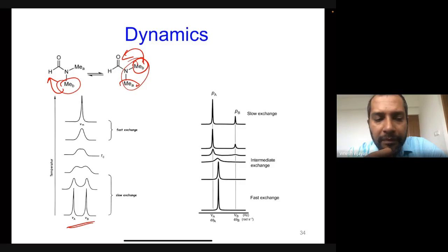The Carolite student whom I work with in her master's, actually, we looked at a similar single molecule, a small molecule, where it ends up sampling two states that are in slow exchange. We are working on the manuscript, and we'll be more than happy to share it once that comes out. But basically, the long and short answer for you is that NMR would be able to look at conformational isomers much more easily than any other technique that you can find around. That's the answer for you, Anju.